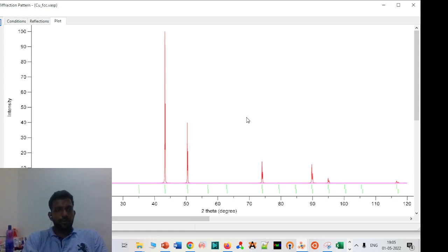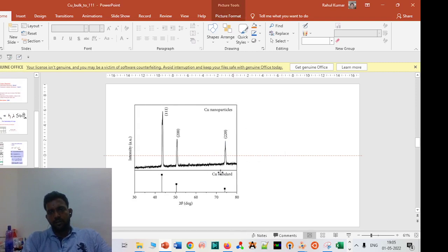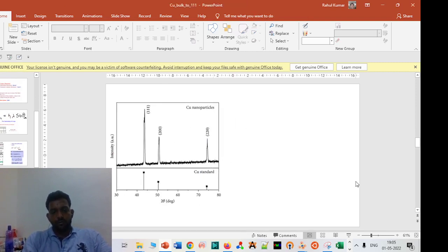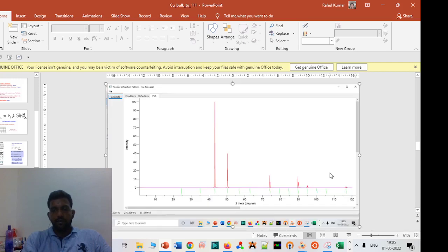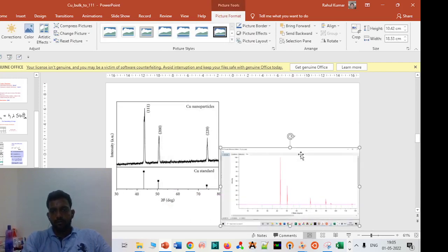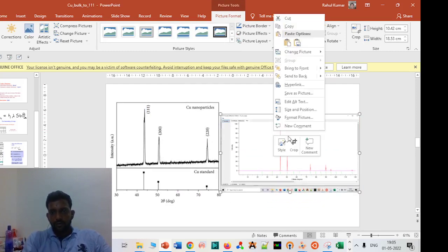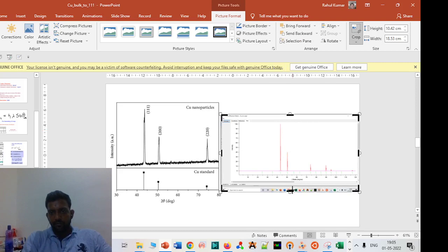Let me just print this screen and go to a sample XRD. We can also use it as a sample to check whether the FCC files we are using are okay. So please, if you are not able to see it, that's not my doing, it is just because the default settings are like that.